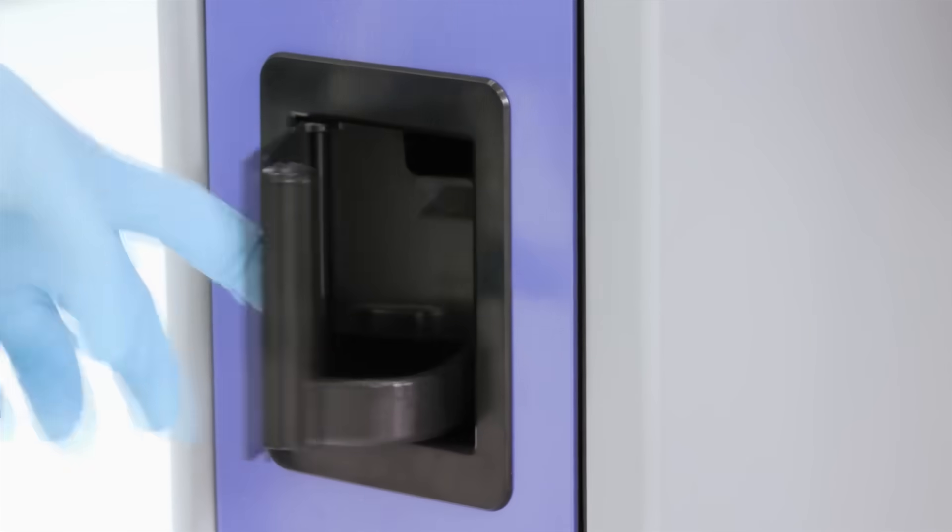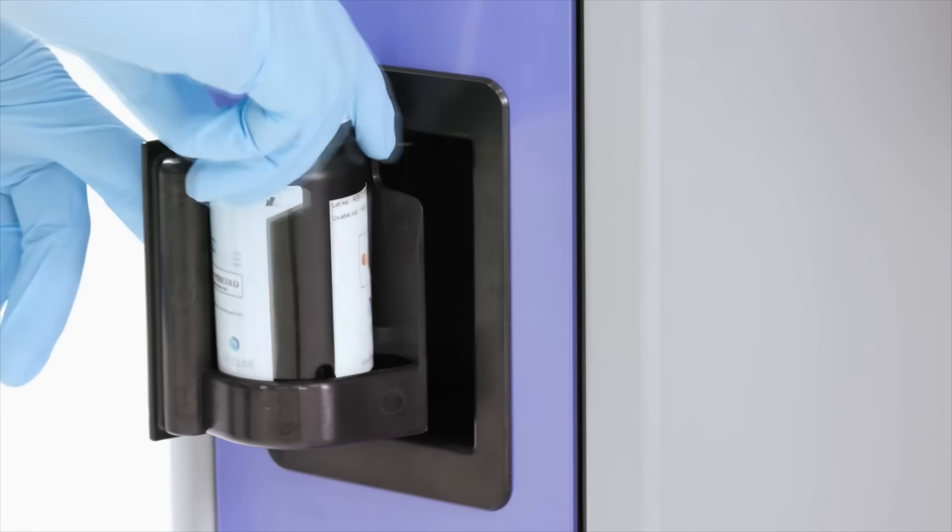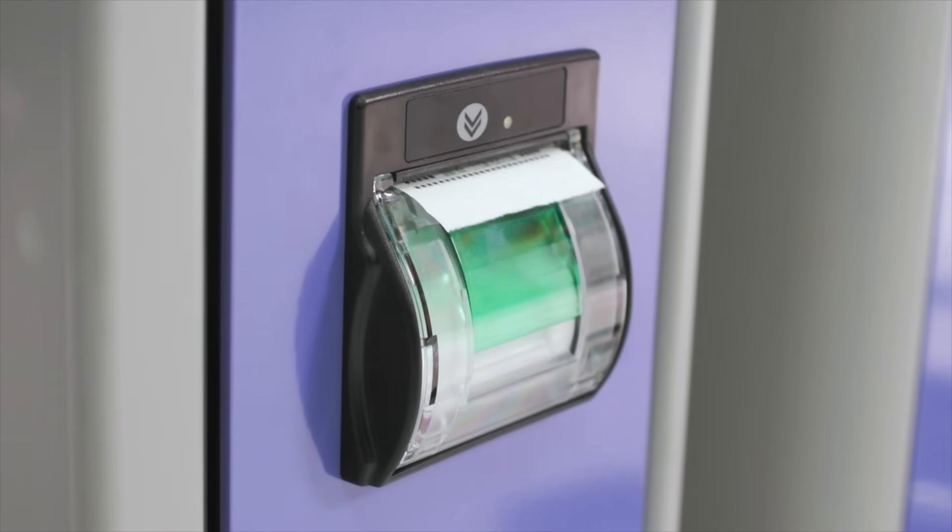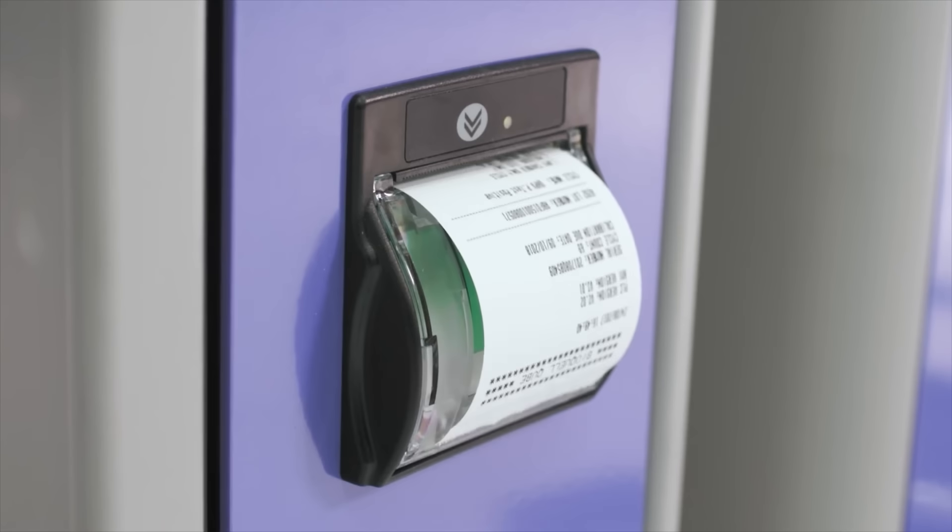At all times, you have full traceability and quality control through RFID tags on hydrogen peroxide bottles, environmental monitoring, and printed cycle reports.